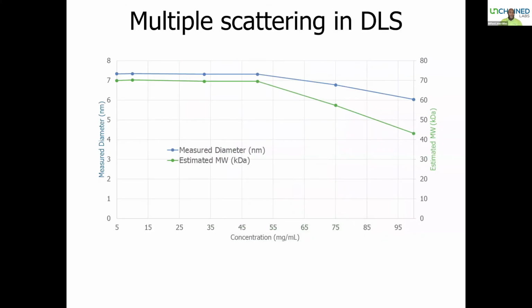So as you think about operating at high concentrations, DLS has one limitation that's built into it, simply that there's something called multiple scattering. What it actually means is that as your laser comes in, it enters your particle, and it's going to bounce around multiple times before it scatters back to the detector. And that's called multiple scattering.